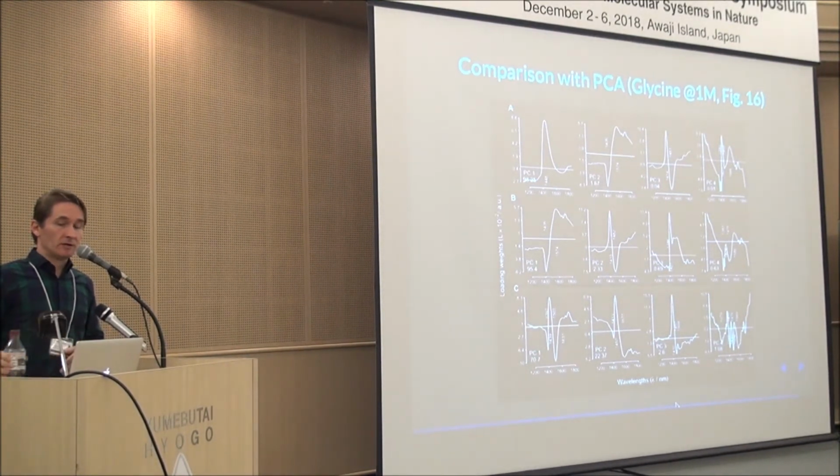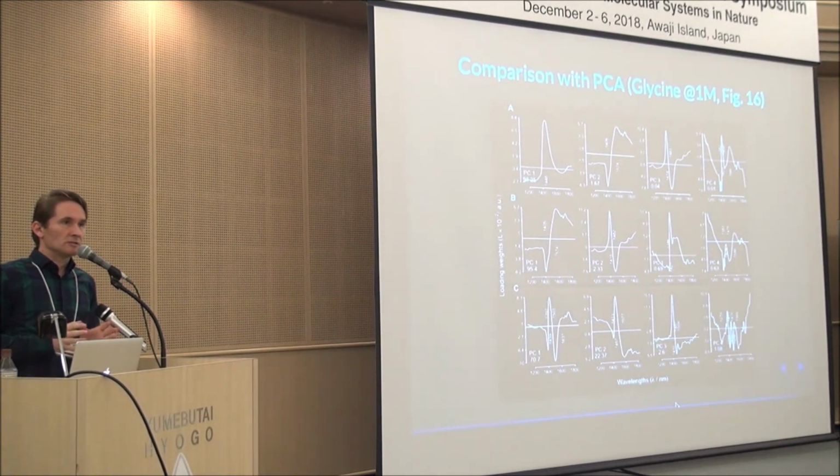That's an advanced step, I hope it will happen in the next work. My idea right now is, after subtraction, to keep the spectrum of pure water that was subtracted. Usually with pre-processing, some information is lost, and there is always that doubt hanging in the background: have I done something wrong, have I lost something?